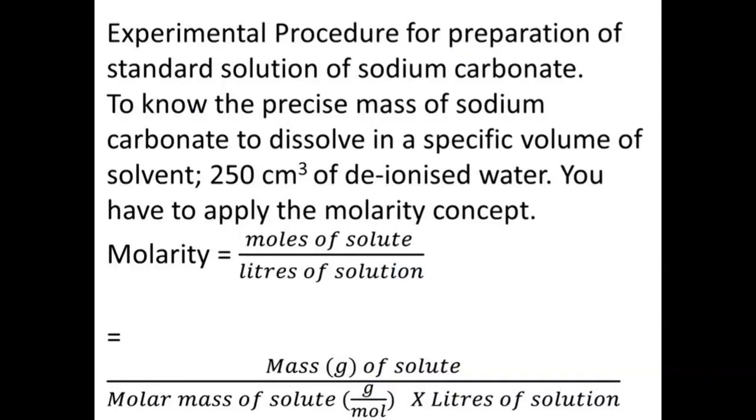What we are going to experiment on is, we want to prepare a standard solution of 1 molar sodium carbonate. And to do this, we follow the following experimental procedure.